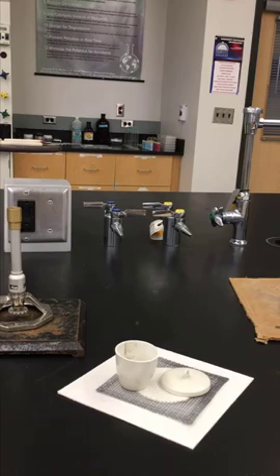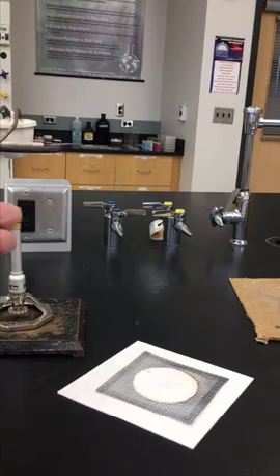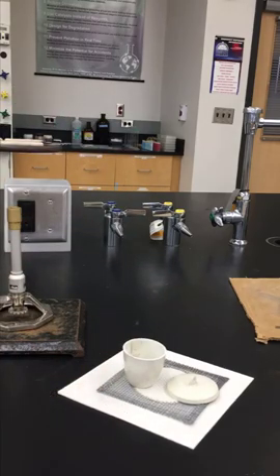After you get that mass, you're going to heat it one more time. Actually, two more, maybe two, but at least one more time. Put the lid back on. Heat it hot for five minutes. Take your lid back off. Take this container off. And you're going to let it cool for another 12-15 minutes. Once it is cool, look at your two masses. Get the mass of this second heating of the sample crucible and lid. And look at the difference of the two masses between the first and second heating. If the difference between the two masses are less than .005 grams, you are done. What we're trying to do is get the constant mass where the mass does not change. If your mass is greater than .005 grams, you will have to heat it a third time. And if you do this carefully, hopefully you will not have to heat it a third time again.